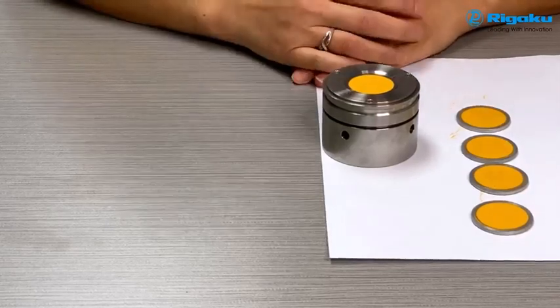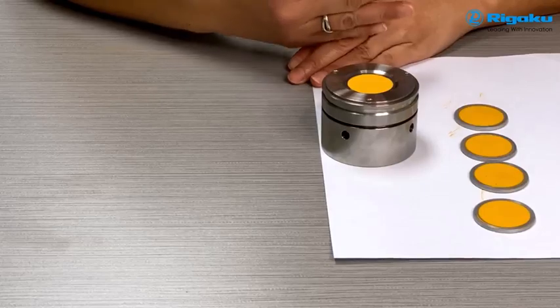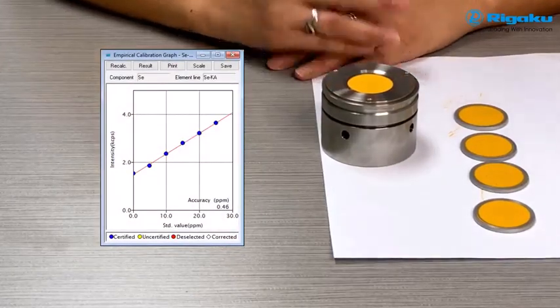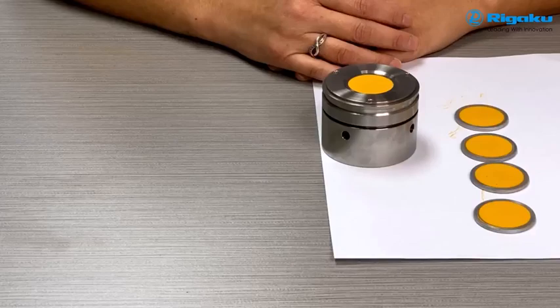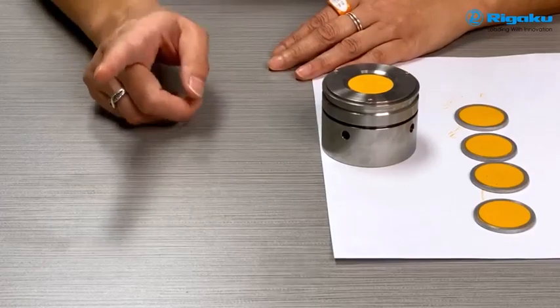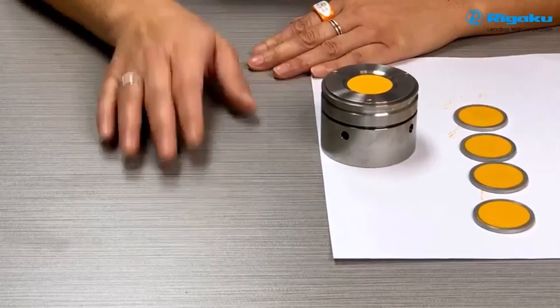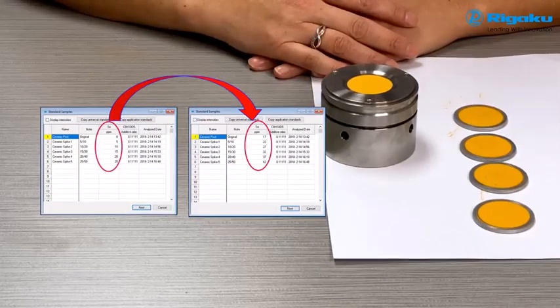Okay. So once you create the calibration curve, you should see a positive intercept because your material has those base elements in there, and then you added those extra standards in, hence the standard addition. Especially if your base material was really dirty, you're going to see a higher positive y-intercept. Exactly. Or a lower one. And as you can see from this flyup here, the x-intercept we see from the dashed line is the base amount of their sample, right? And then what you would want to do is take that amount and add it into your calibration curve to adjust it.